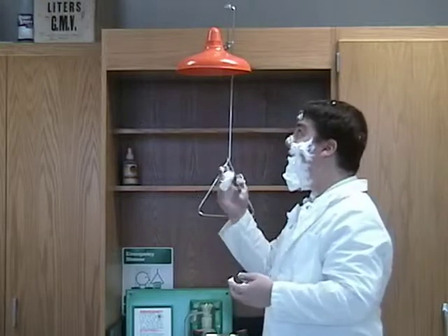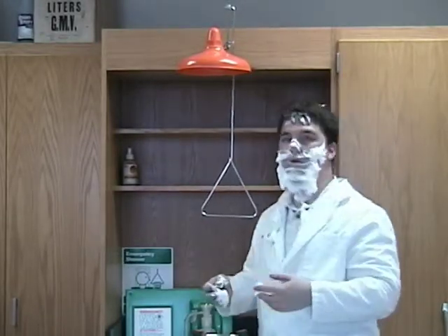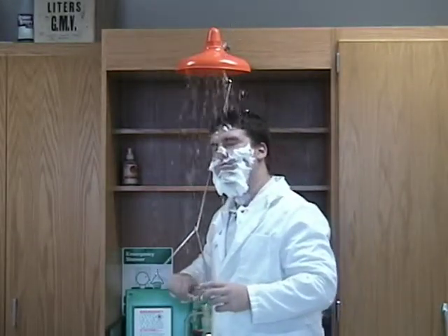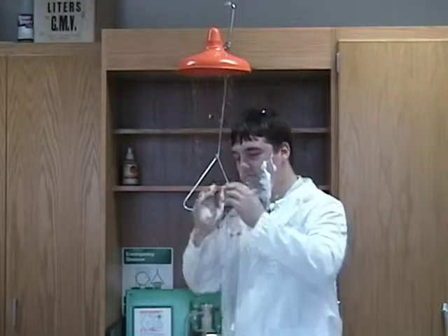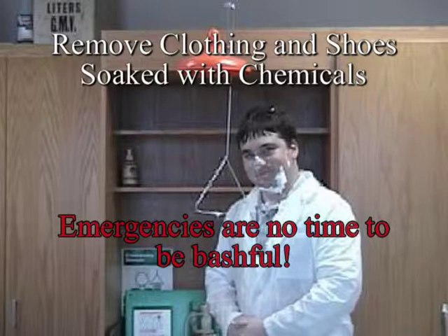If that's the case, bring yourself over here and if you need to, get some help from your lab partner. Come over to the safety shower. The point of this device is to get as much water onto you as quickly as possible so that the chemical gets off of your skin and out of contact with your clothing. All you do is come up underneath here — and I remind you, this is only for emergency purposes. You come under the shower, grab onto the triangle, and pull. Had this truly been an emergency, you would remain under here for an extended amount of time, not just the couple of seconds I remained under here. If your clothing or shoes become soaked with chemicals, they need to be removed immediately. Emergencies are no time to be bashful — better to deal with a bit of embarrassment rather than scars that could last a lifetime.